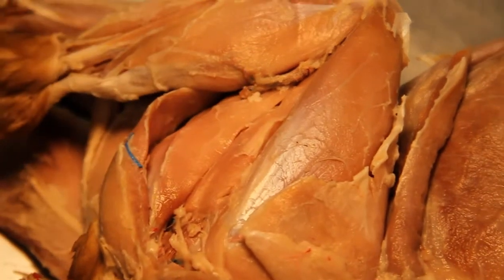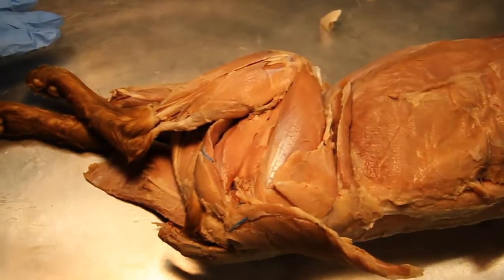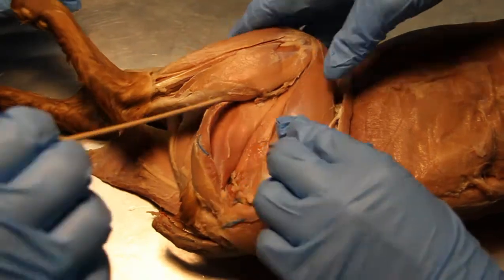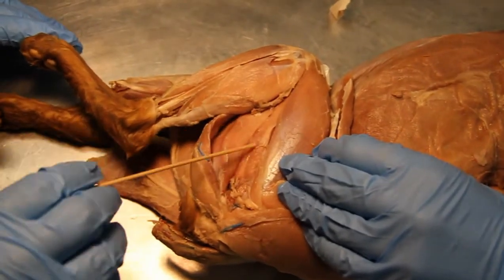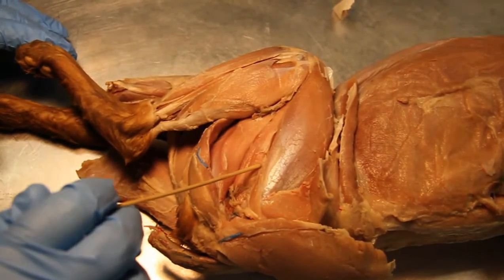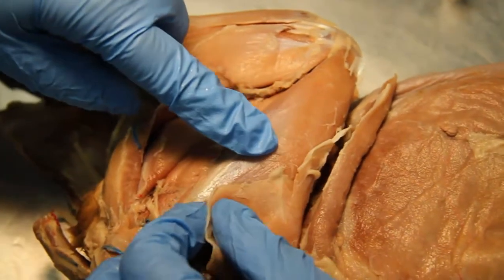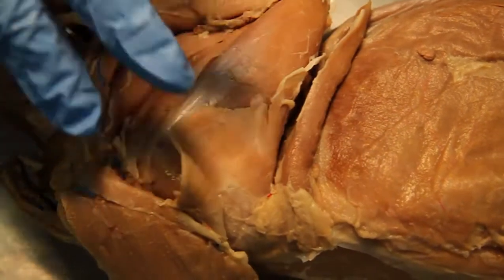Semitendinosus, semimembranosus. What's that one? Looks like fish skulls. I think that is the adductor femoris. And then this is the adductor femoris. This one's the semitendinosus. Semimembranosus, adductor femoris, vastus lateralis. Vastus lateralis. Pectineus.